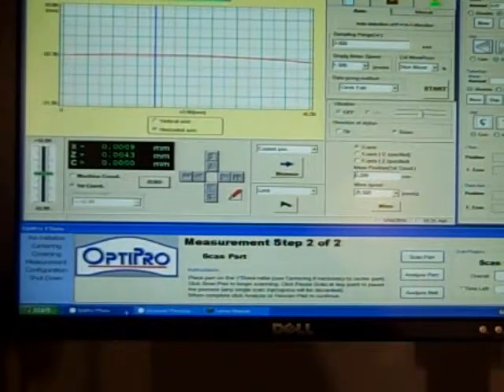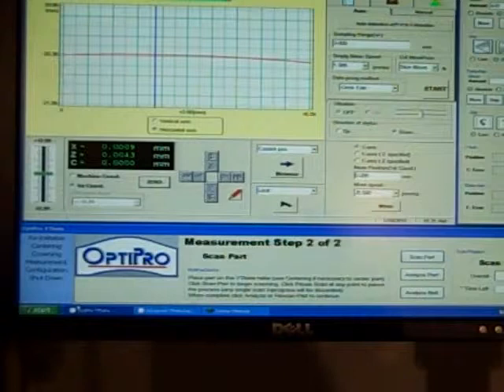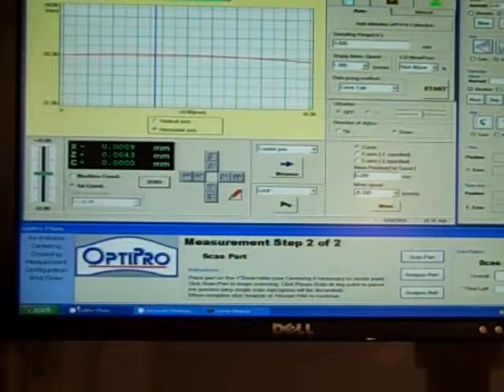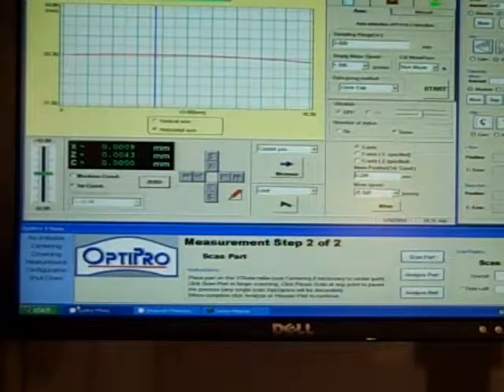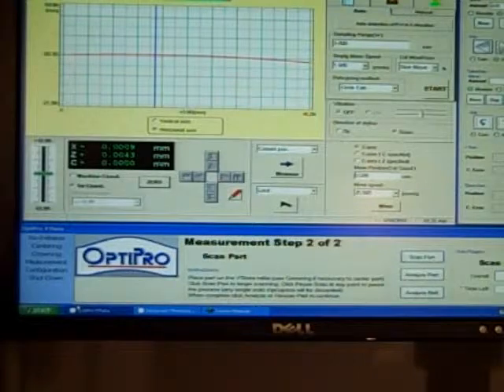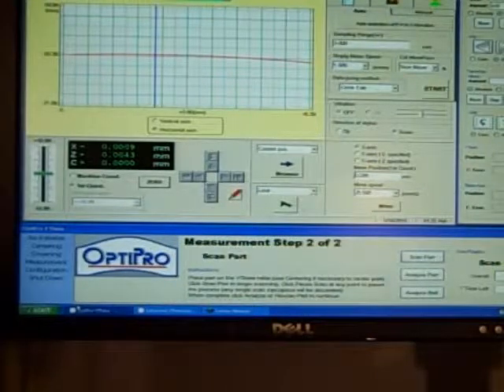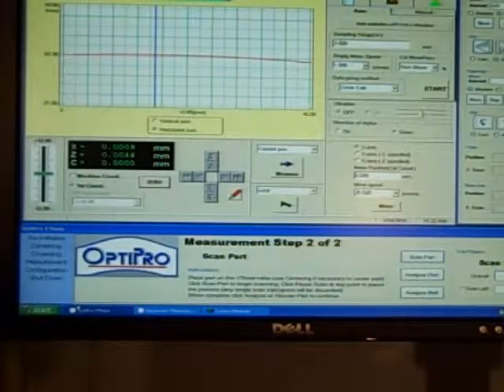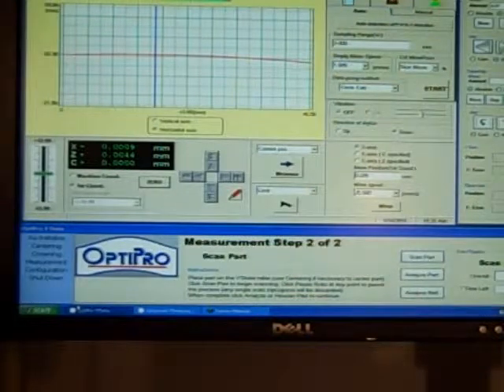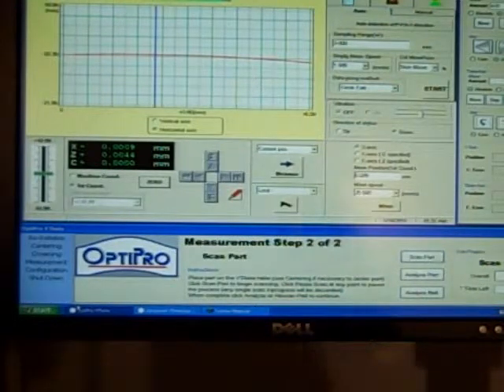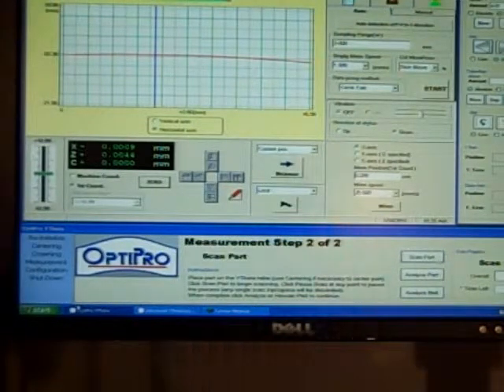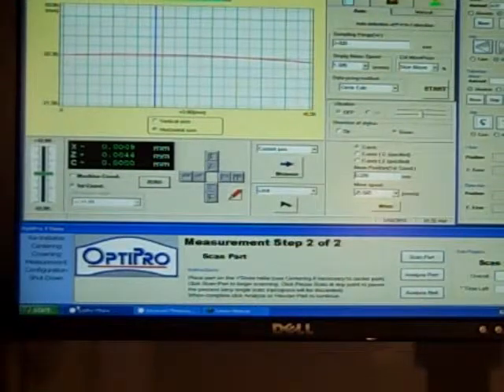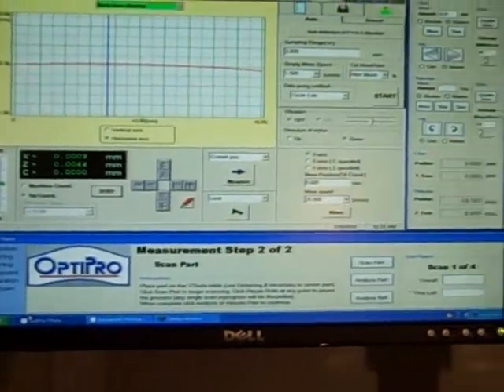The analysis of the A-sphere uses our specialized A-sphere analysis tool where we can optimize the radius of the A-sphere and then also look at the frequencies, slope errors, and other analysis tools within the software. And here we'll actually measure the optic itself.